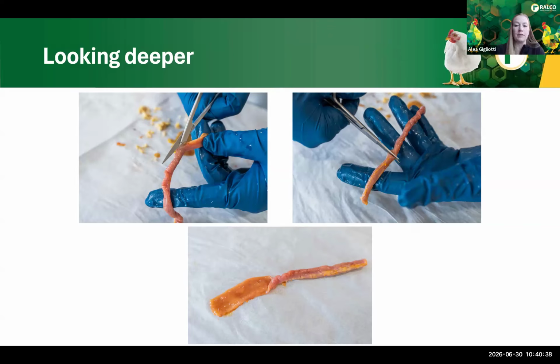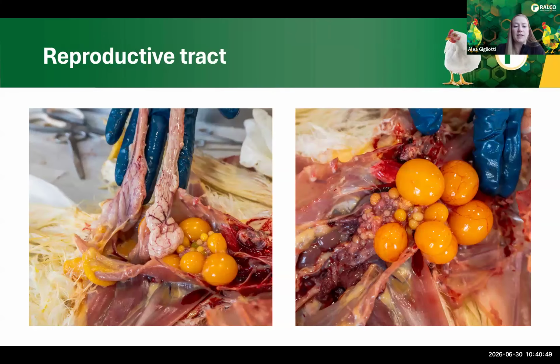Worms are often going to live inside of these intestinal tracts, and by cutting them open, you can expose that and kind of see those pretty obviously. This method can also be used to take certain samples, but again, work with that diagnostic lab, and they'll typically provide you with instructions for that.